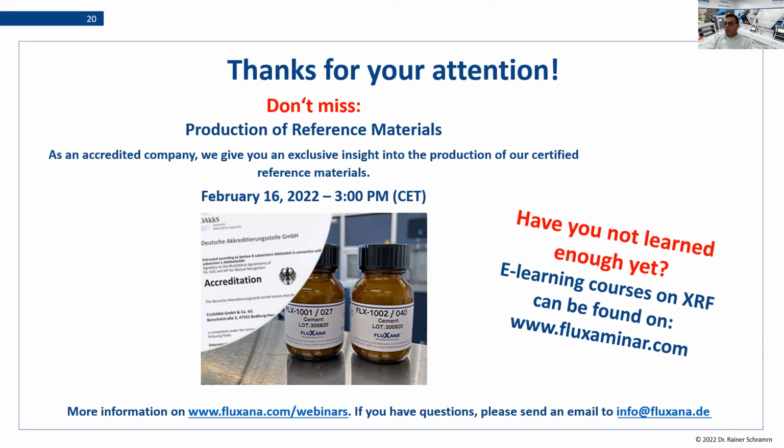Then someone asked about L lines. He knows L alpha and L beta lines. Okay, other L lines are also part of the element line table. So if you go to a physical line table, you will find there for every element these kinds of lines. Just have a look there.